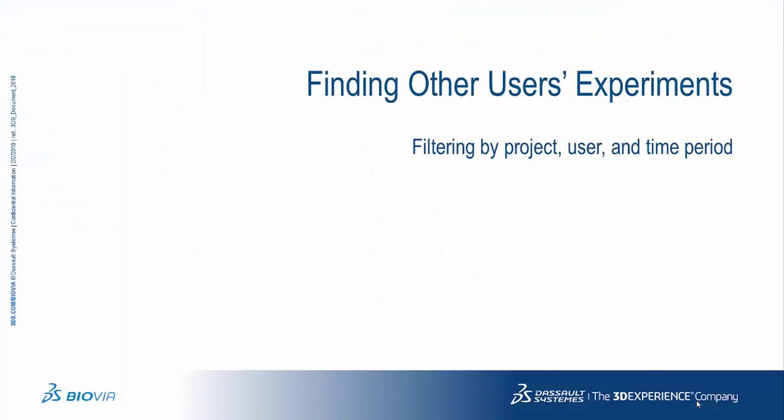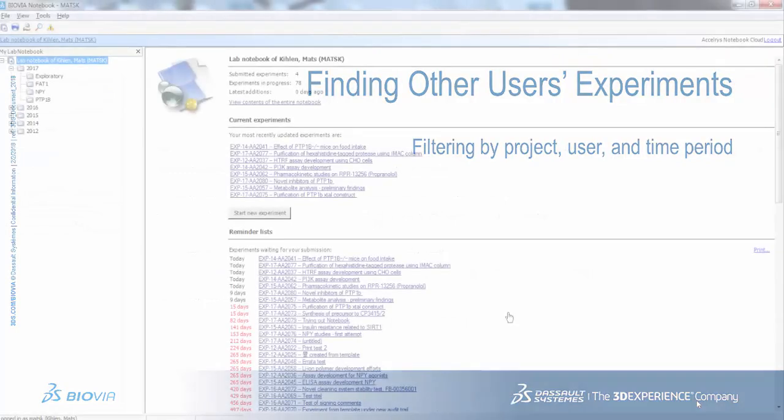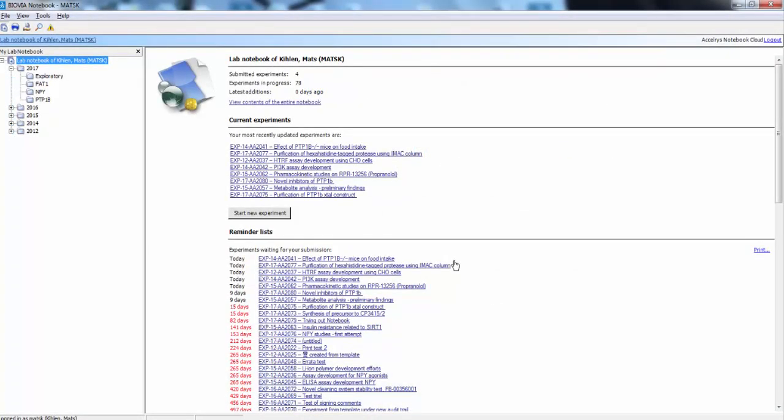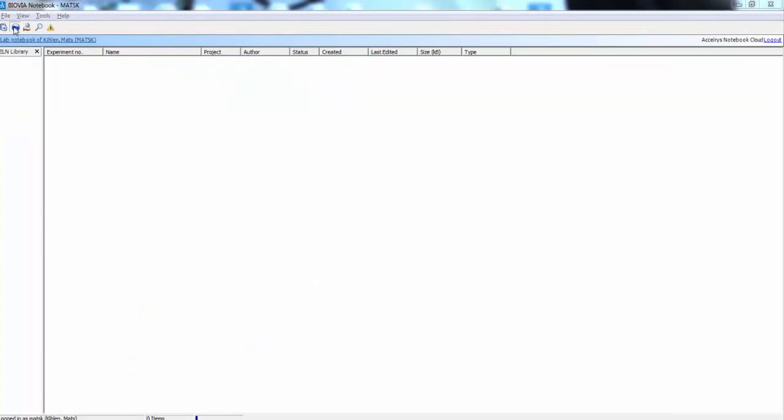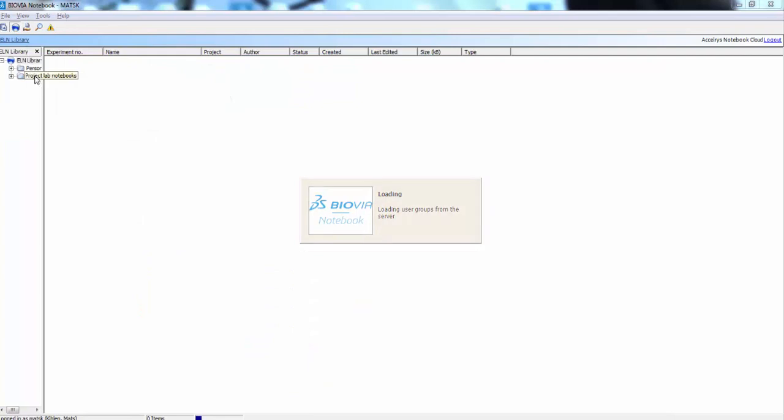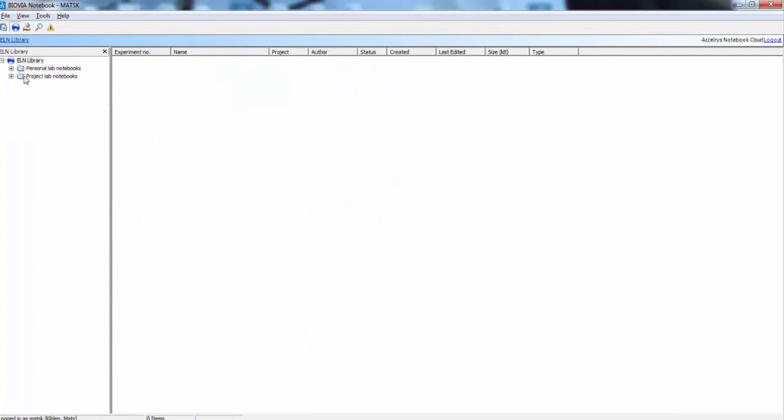To find other colleagues' experiments in the Windows client, you would go to the Global Library and then navigate in Personal Notebooks, sorted by name, or in Project Lab Notebooks.